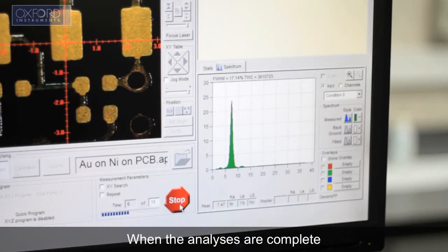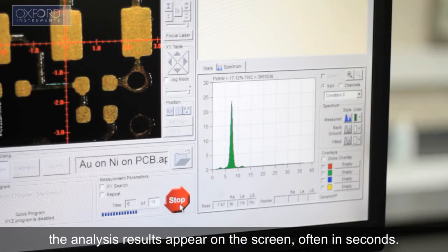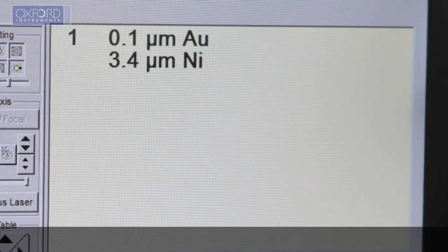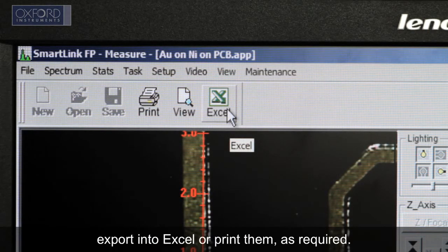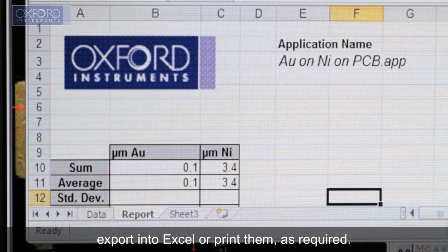When the analyses are complete, the analysis results appear on the screen, often in seconds. You can then save the results for future reference, export into Excel or print them as required.